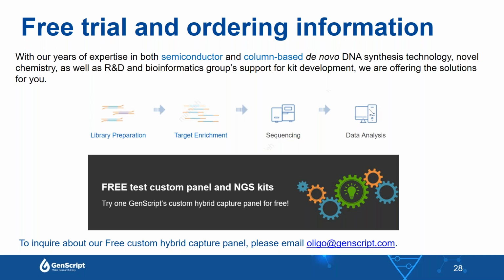So stay tuned. Okay. The seventh question is, how is the compatibility of the GenFisher panel with other hybridization kits in the market?